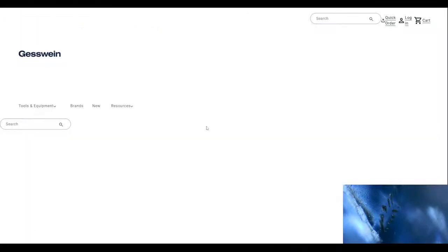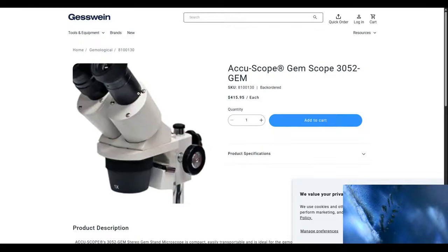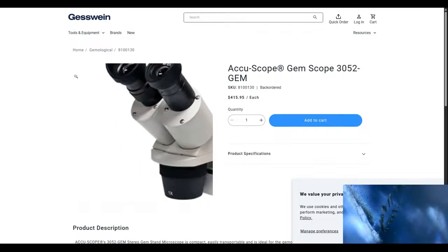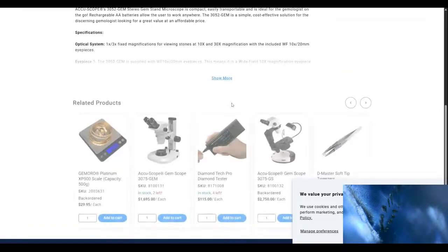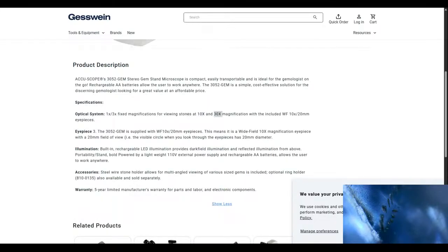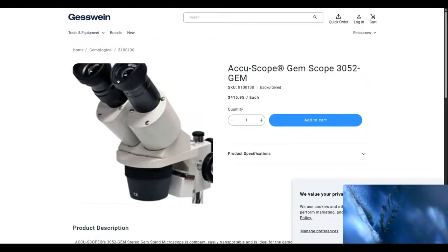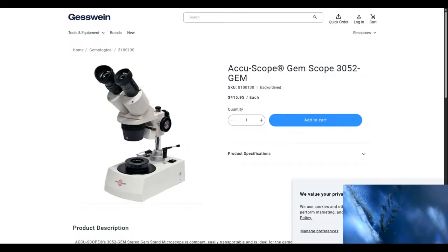Hey, you need to buy this microscope. That's a horrible microscope, bro. You can't even see 3-phase inclusion with this. How many X is this? 10 and 30. 30X, guys. Yeah, don't go to that school. If they give you a 30X magnification, don't do it, guys.